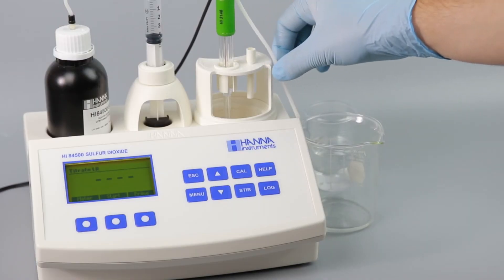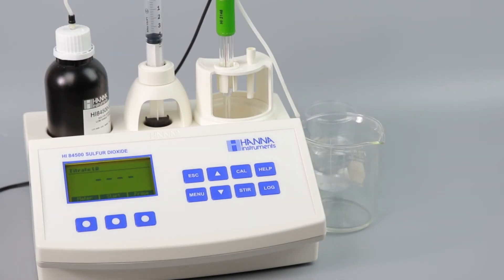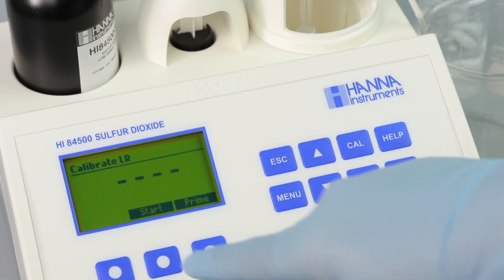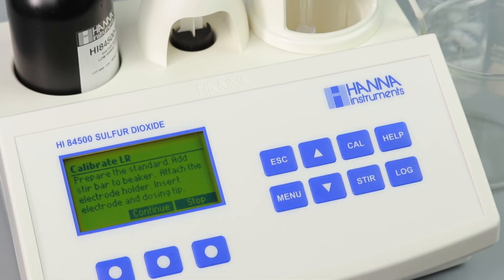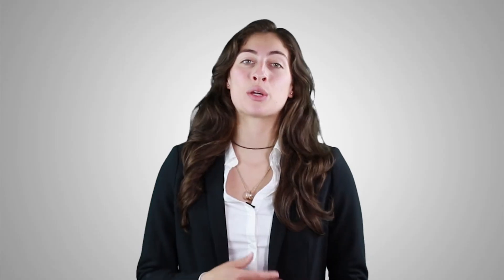Once your calibration sample is prepared, place the dosing tip over a separate waste beaker and press the Cal button, then Start. The syringe will refill and rinse the tip. After, the process will pause so you can put everything into place.